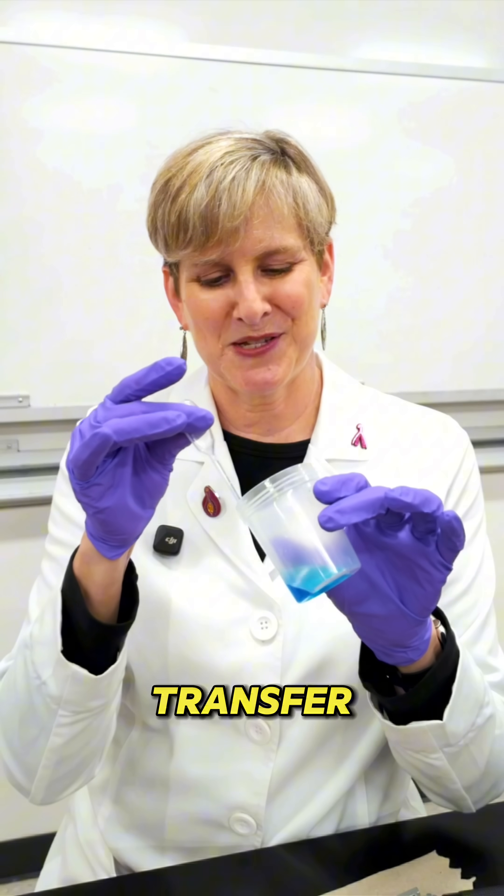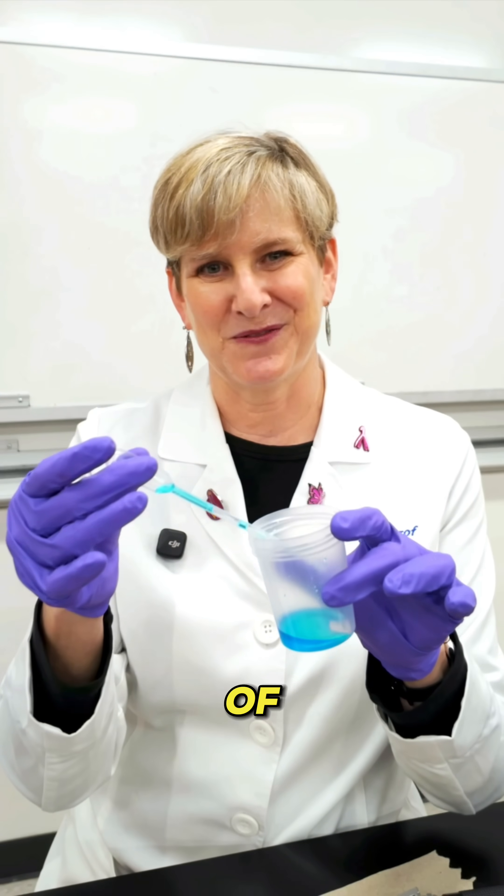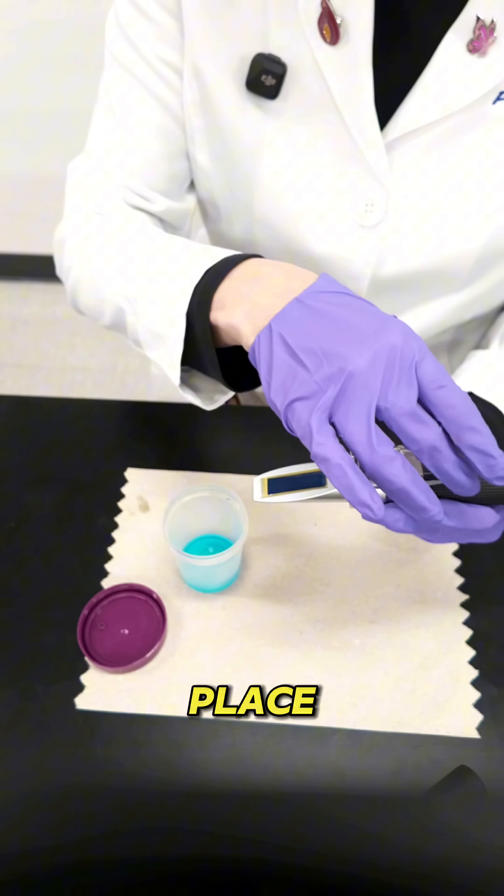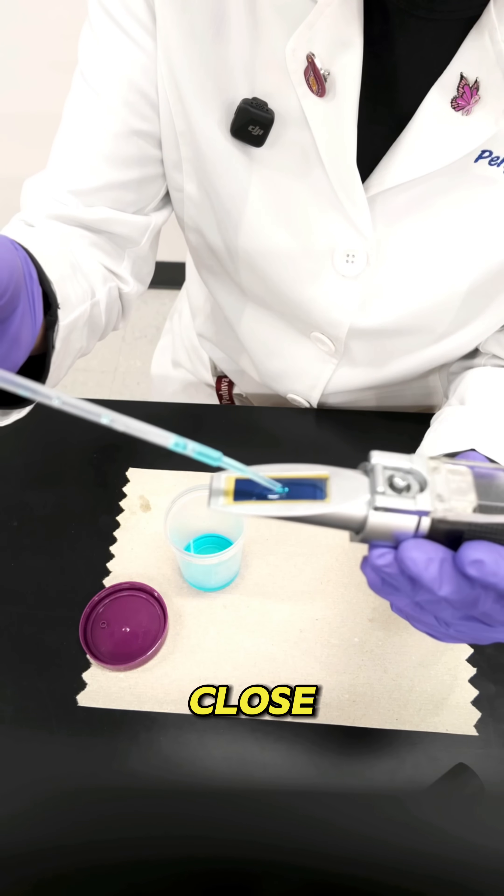Get yourself a transfer pipette, these are disposable, you only need a couple of drops. Lift the lid and place two to three drops on the window and then close the lid.